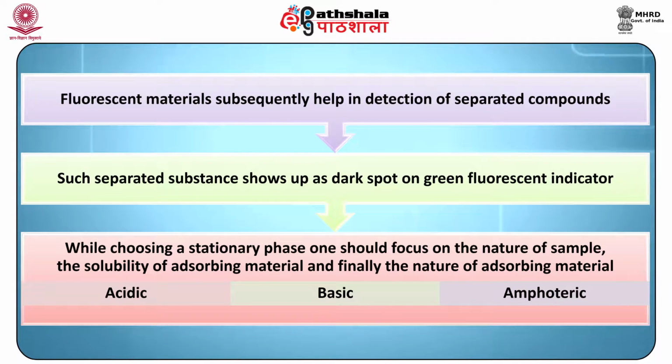While choosing a stationary phase, one would focus on the nature of the sample, the solubility of the adsorbing material, and finally the nature of the adsorbing material, such as acidic, basic, or amphoteric.